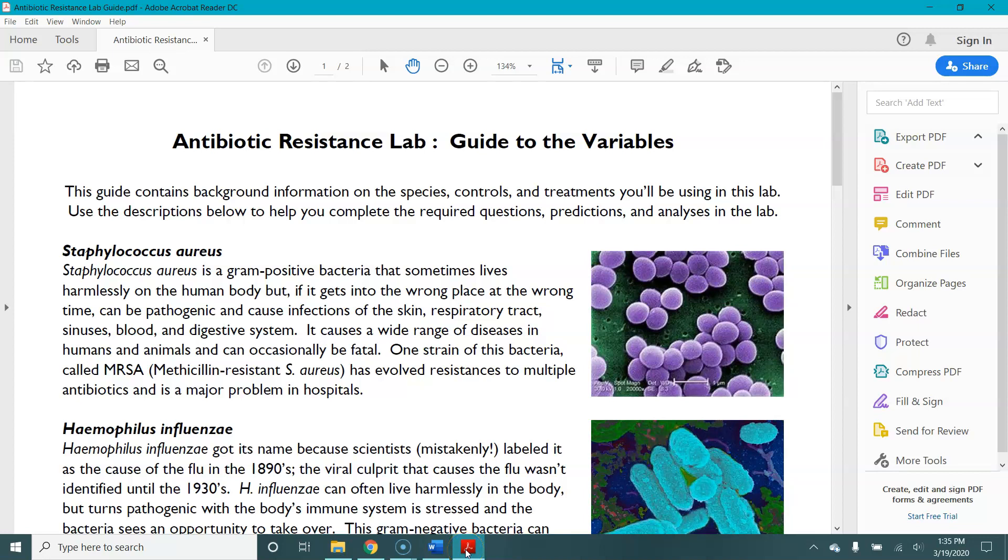Welcome everyone to our virtual lab on antibiotic resistance. This video will tell you how to access the lab, how to activate it on your computer, and how to use the tools in it.